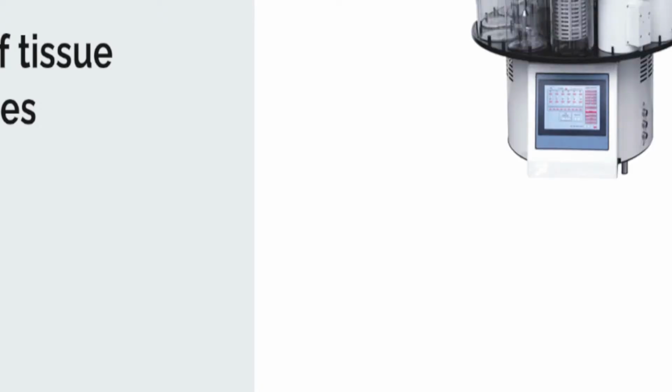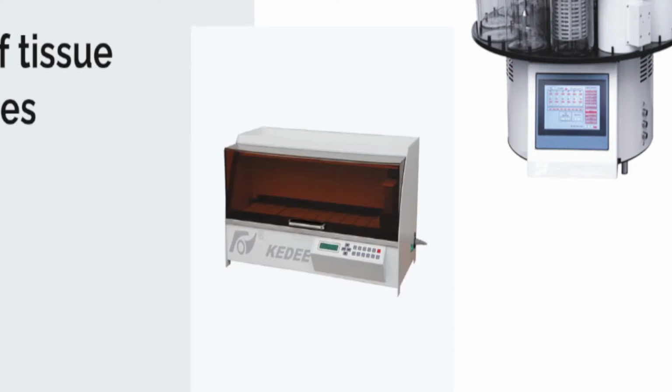So there are types of tissue processors. This is your can type or your cylindrical tissue processor, most common in the laboratories that I've worked in, in the Philippines and in the Middle East. This other one I think is something that I'm new to. I didn't know about it until last semester when Mark Segi told me that a certain hospital where he interned had that particular model. That's new to me. Okay.